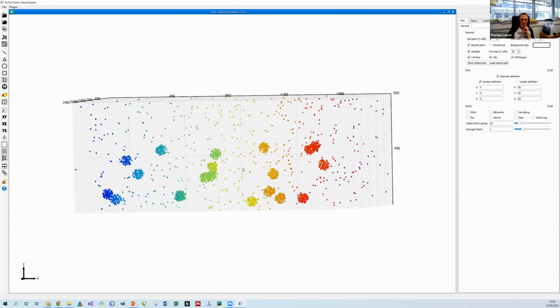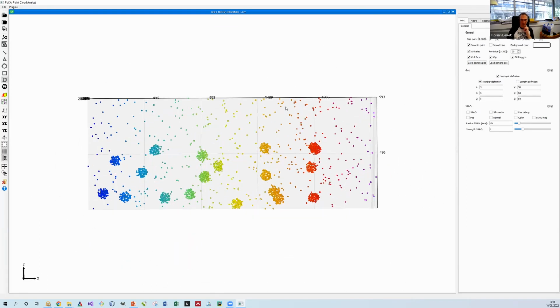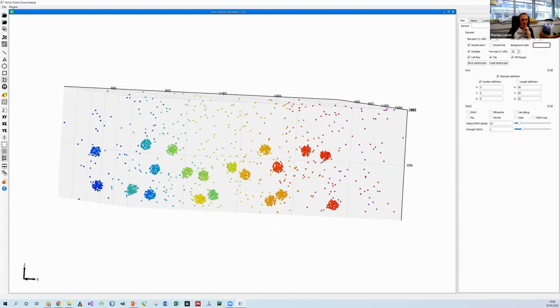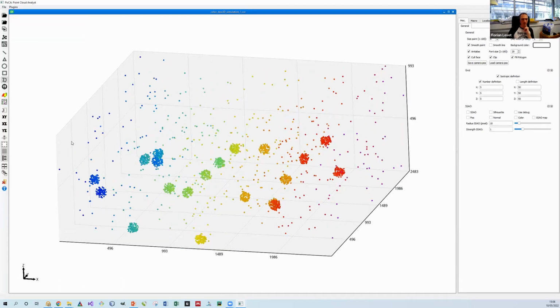In this case, you can see that the simulation I have done is pretty bad because there is a lot of space where there is no cluster. So you can do some very fast cropping first, but it's only for visualization. So let's say that you want to go to some cluster. You have the choice of the three frames, XY, XZ, YZ.